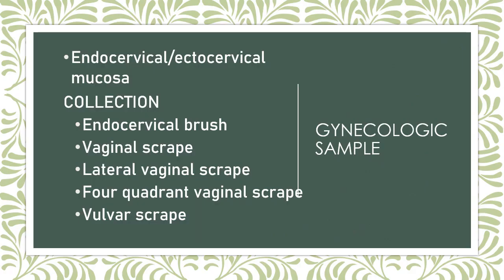Let's take a look at your gynecologic samples in more detail. These are from your endocervical and ectocervical mucosa. Most cancers arise from the junction of your endocervical and ectocervical mucosa, that is at your T zone.